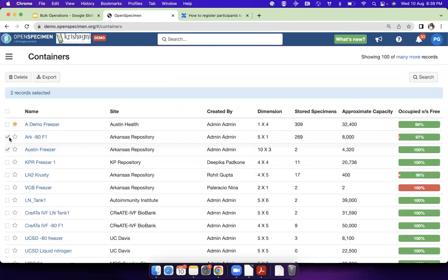So if I select, right now, if you see, these are the only two operations available. I can delete or I can export. This export option is there for all administrative data. This is useful if you want to export the administrative data setups from one server, maybe the testing or the training server, and move it to another server. You can use the export import feature.